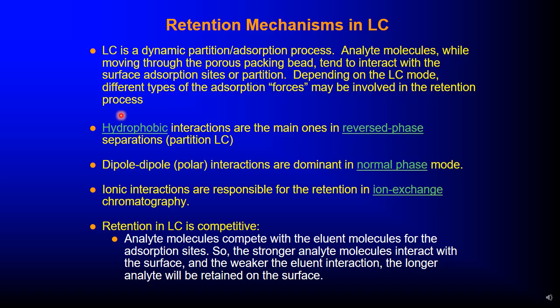Like we said before, some are non-polar interactions, van der Waals, and so on. Hydrophobic interactions are the main ones in reverse phase separations. Remember, here the stationary phase is non-polar. Dipole interactions are dominant in normal phase mode. Remember, in normal phase the stationary phase is polar. Then ionic interactions are responsible for the retention in ion exchange, if you remember.